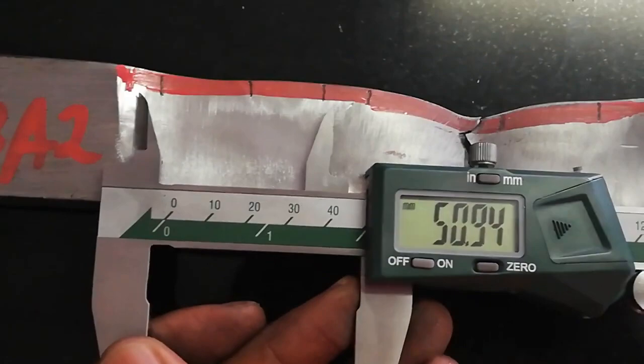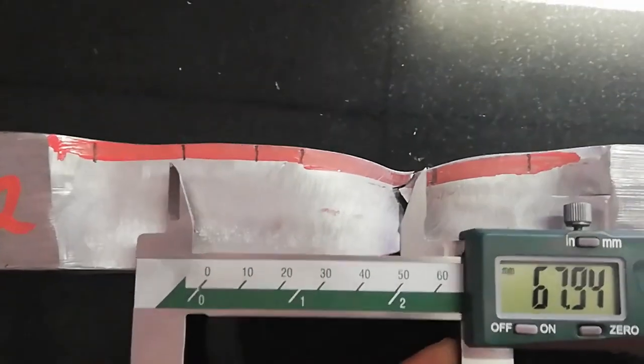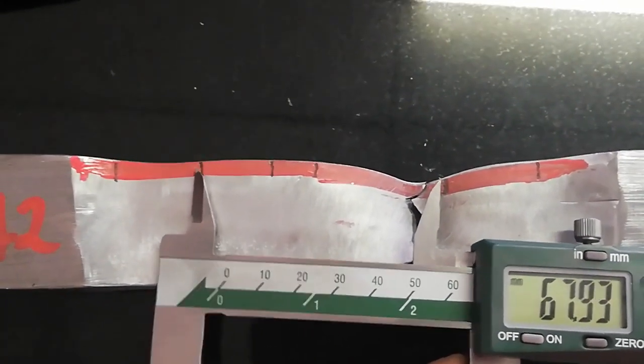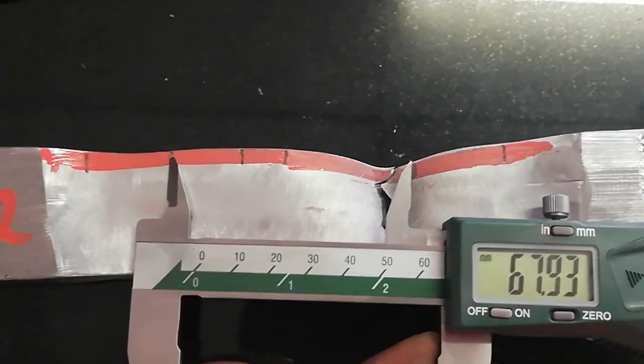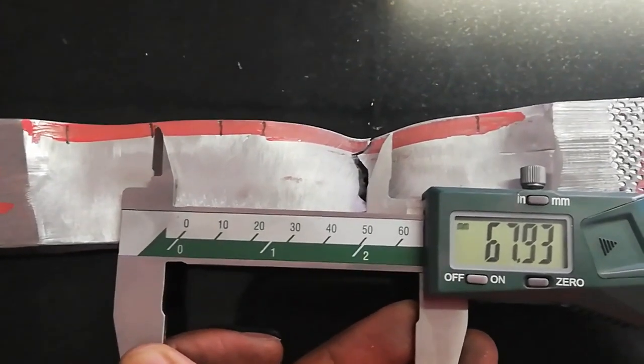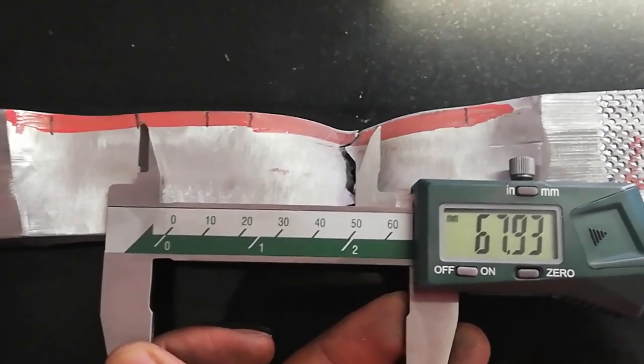So now if I have to measure my extension now, you see my marks there. So now I'm at almost that is 67.93, so 17.93 millimeter extension.